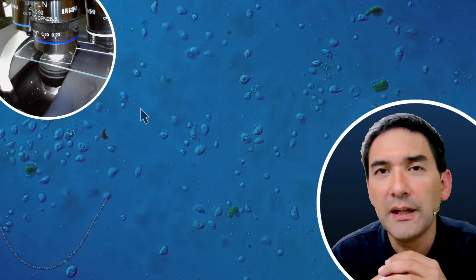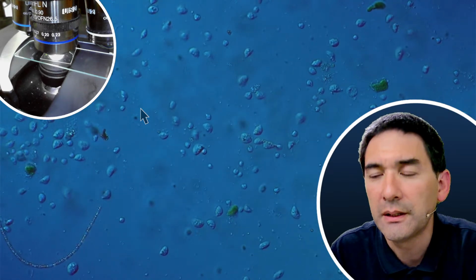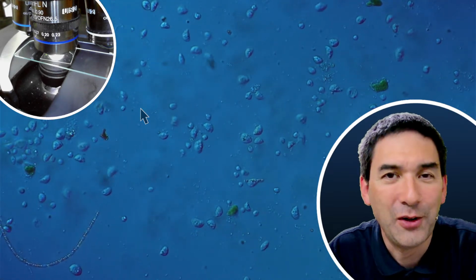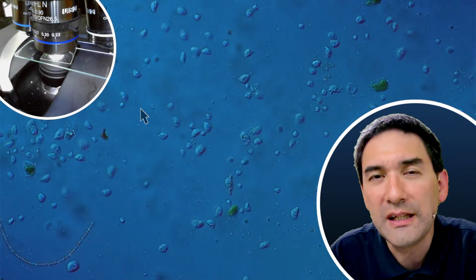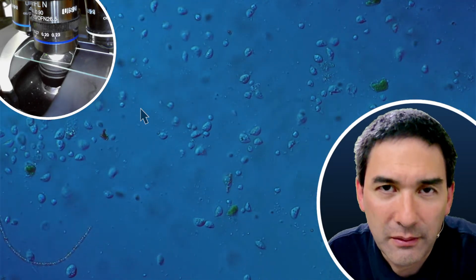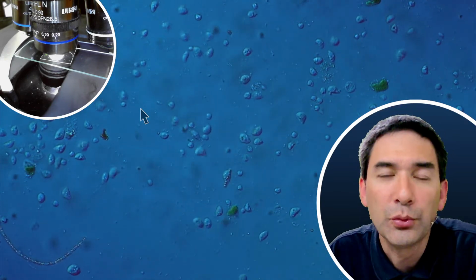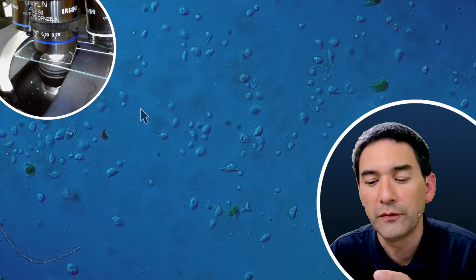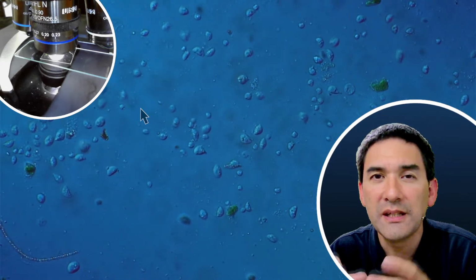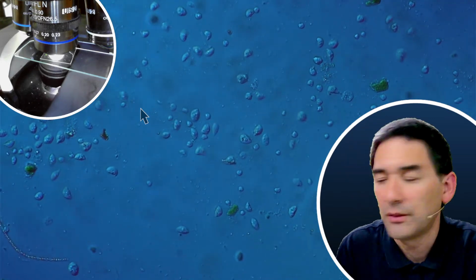So I would say that it depends really what you want to observe, but I have to tell you, I also don't have any space here, and I would not be able to see things that otherwise I would not be able to see. So for my purposes, I do not see any specific advantages right now. But if I were to observe certain organisms inside a Petri dish, then this would of course be a different thing.